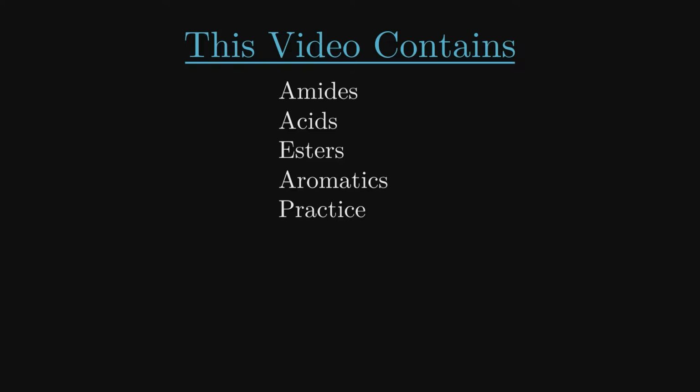In this video, I've simplified the animations to make things easier, meaning I've cut out all electron pairs and most instances of resonance. I will include the charge as it is the cations which are detected.